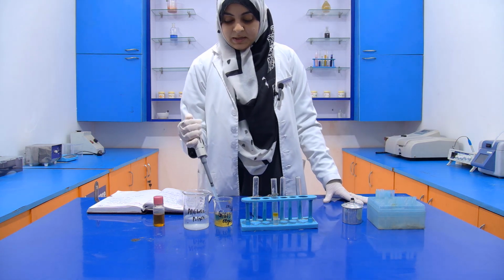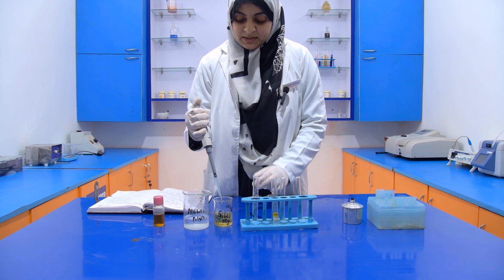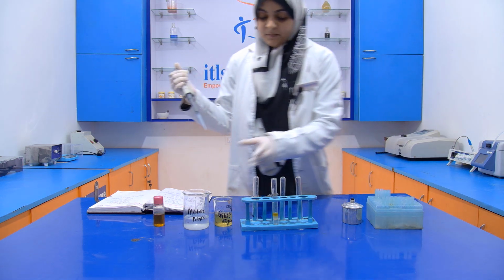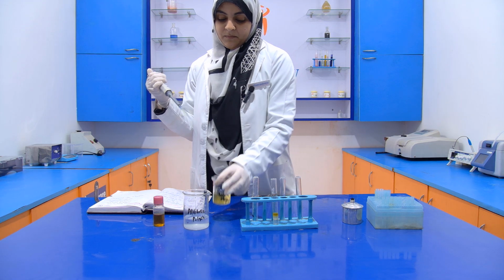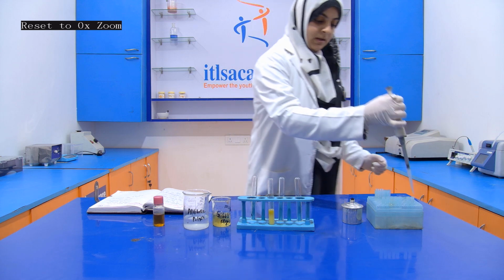This is our Gibbs reagent. Okay, if mobile oil is present, then it turns blue.